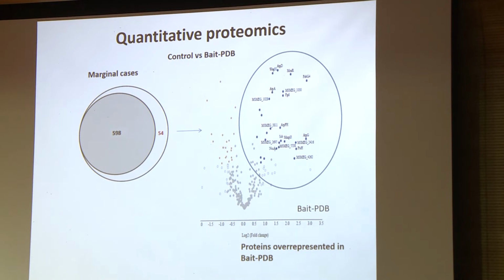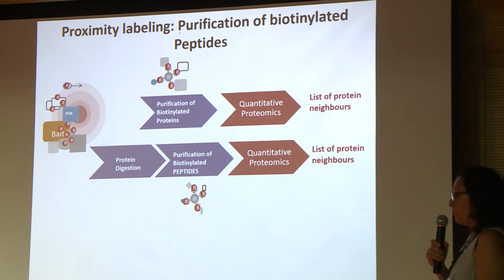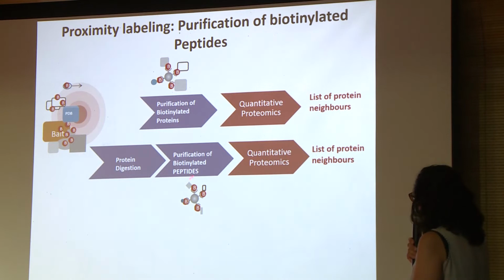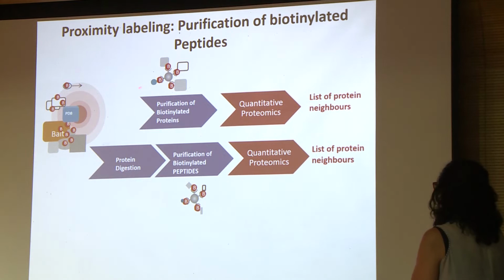So, finally, I would like to show you another approach that can be used for proximity proteomics that is not based on purification of proteins, but on the purification of peptides. And in this case, the workflow is almost the same. It's only that the digestion process takes place before enrichment.